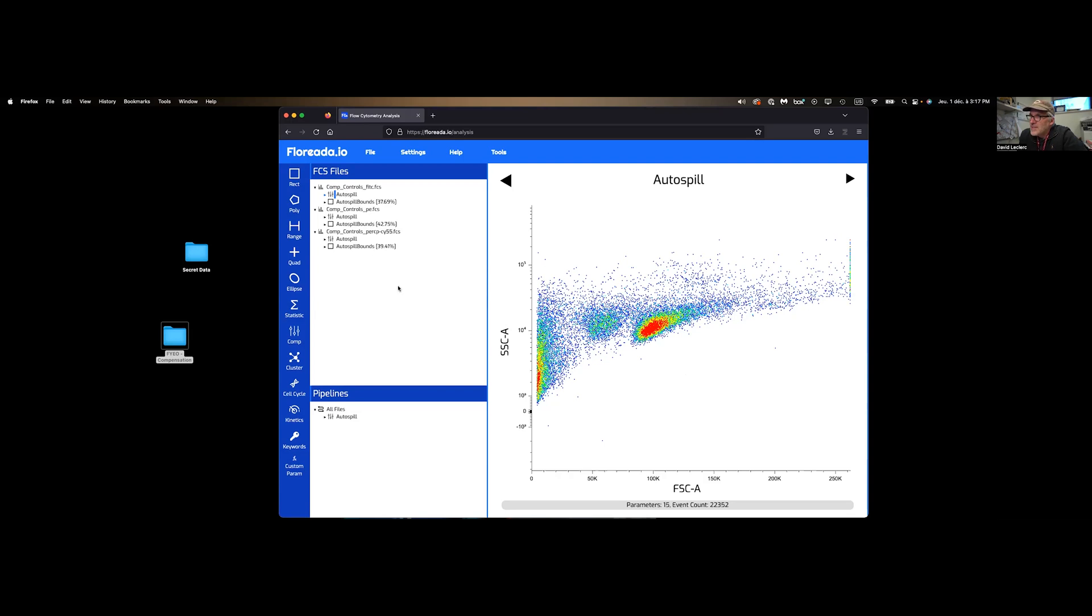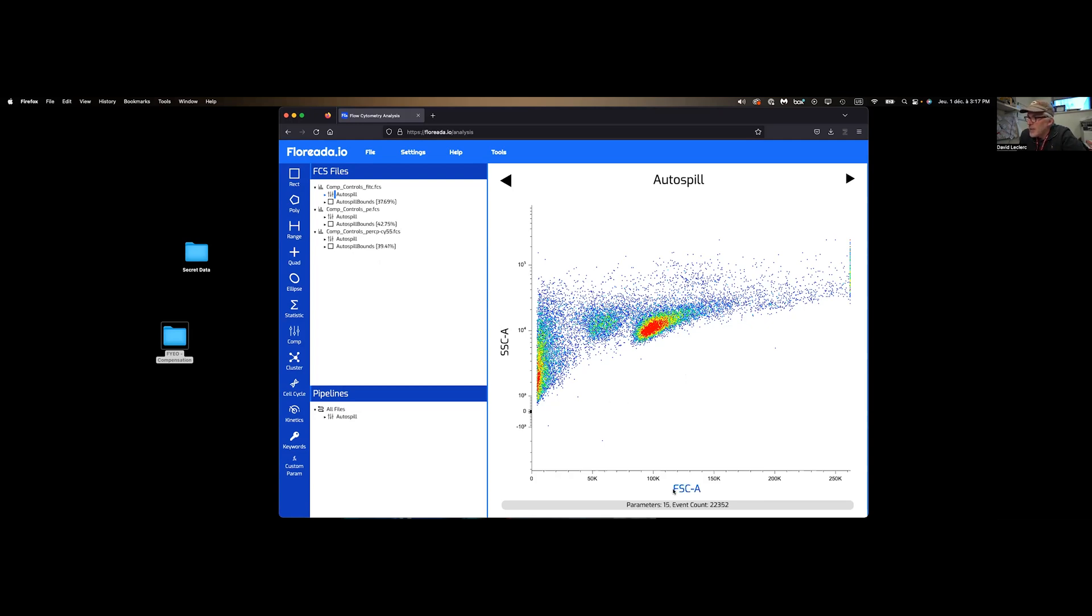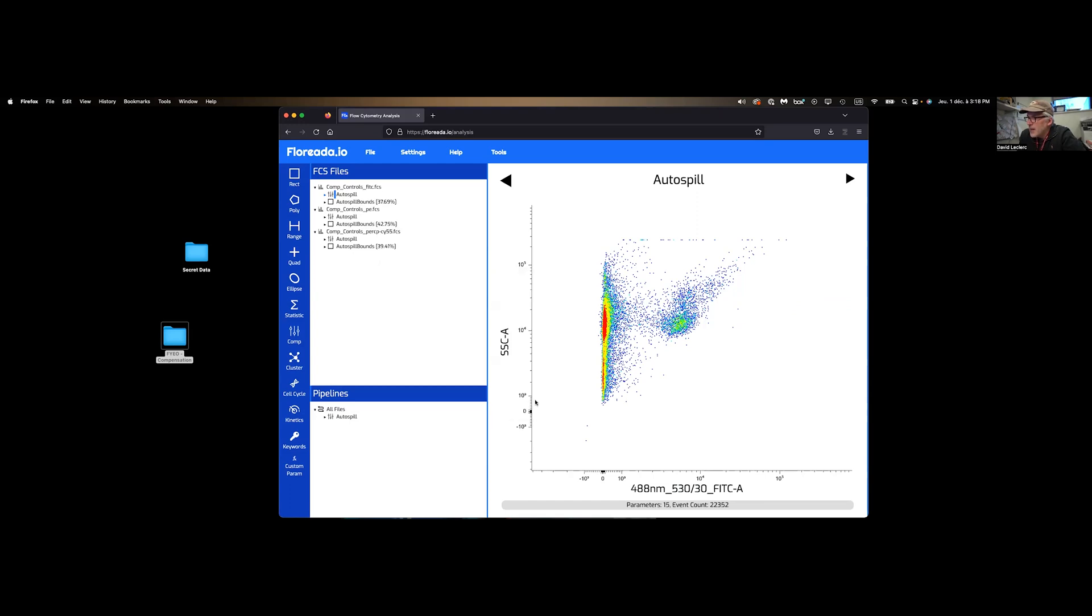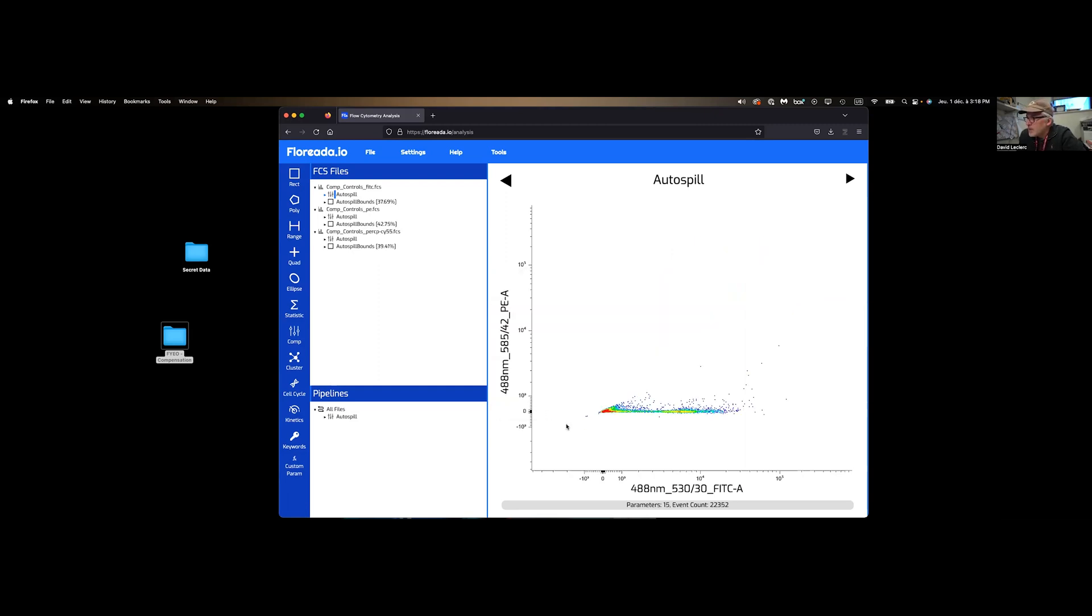At this point, you're going to start your analysis. So let's imagine you would have another sample on which you would apply your compensation. You will start getting on top of that compensation matrix that you've made. And so I can click on my different markers and change the axis to whatever I want to look at.